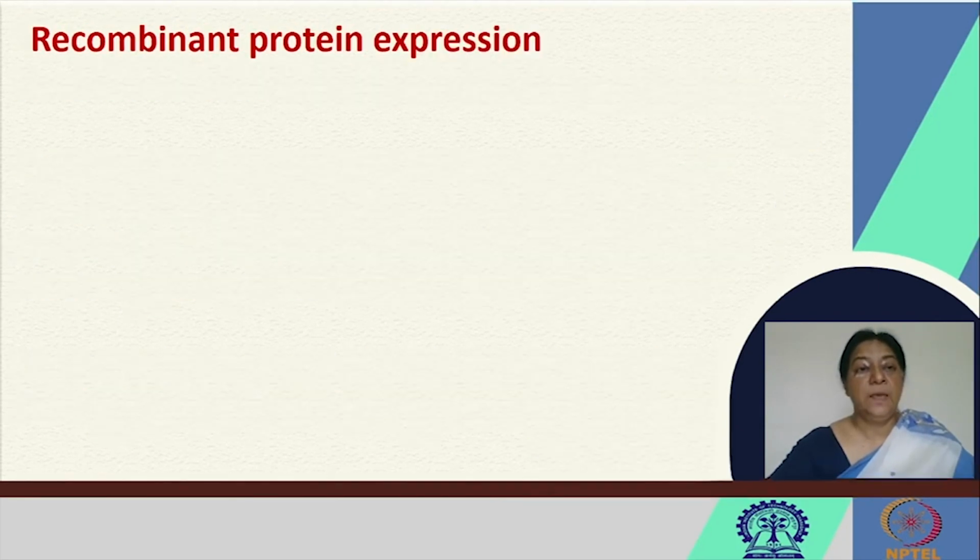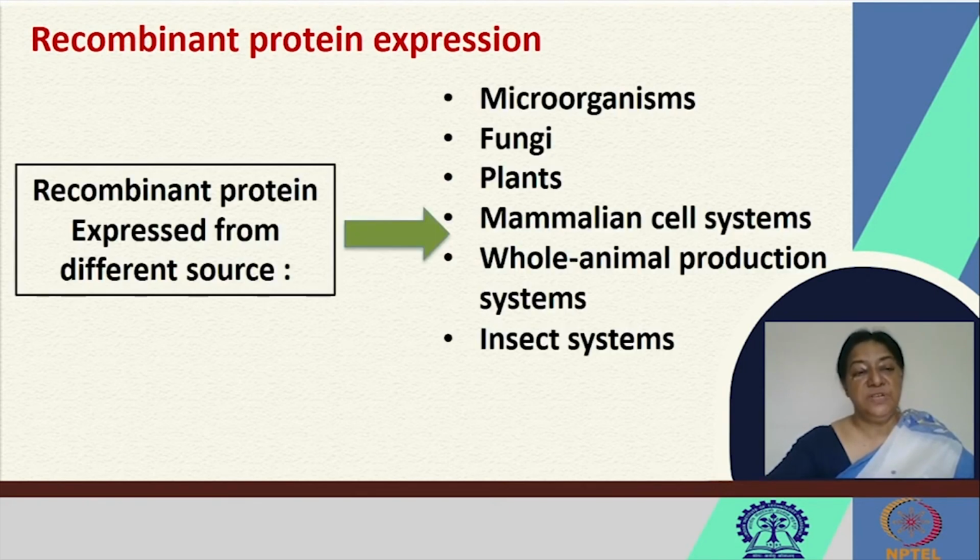In recombinant protein expression, an interesting point here is that we are trying to exploit our bacterial machinery to express the protein of interest.